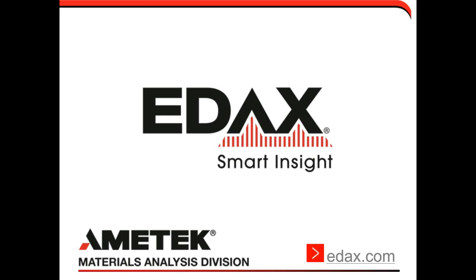Okay, let's see. Next question. Can metal oxides and metal layers be differentiated? Can elements like oxygen be measured, or only elements of sodium and up? We do not measure oxygen in the sample directly. We can only detect directly, depending on the atmosphere and the excitation conditions, starting around sodium and up. In an atmospheric kind of system, we can generally detect around potassium and higher.